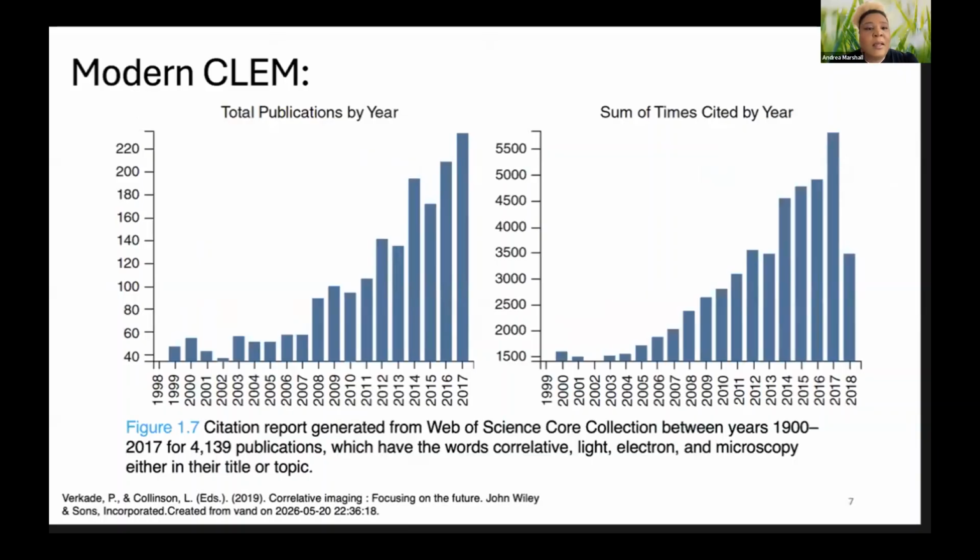So again, what you see here is that as times expanded, particularly from the late 90s into the late 2010s, there is an expansion in the number of publications that mention CLEM in some form, as well as an increase in the citations. So this is a very burgeoning and growing field.